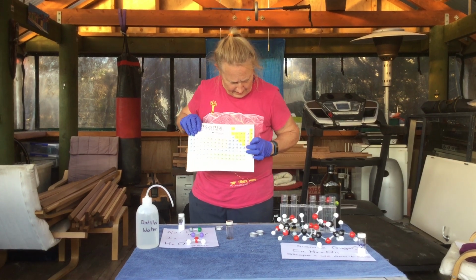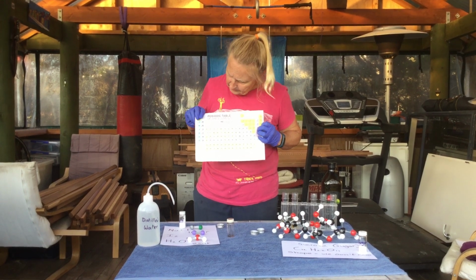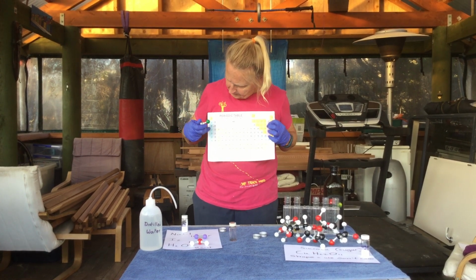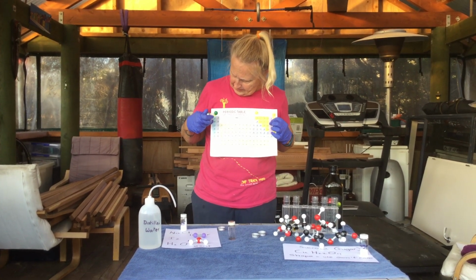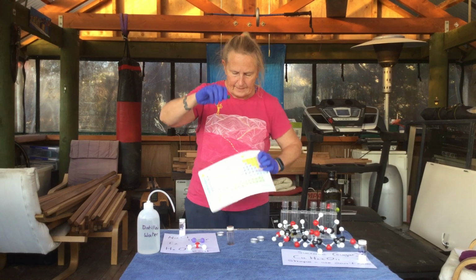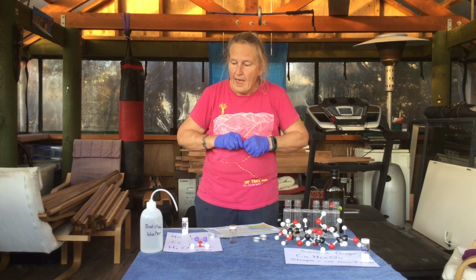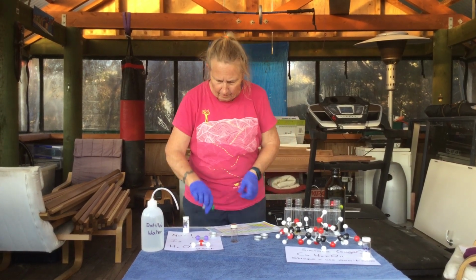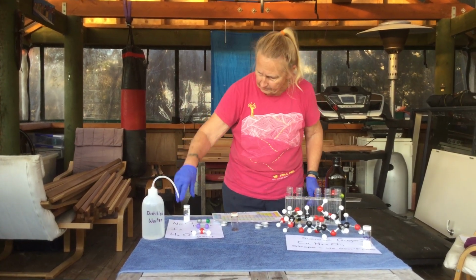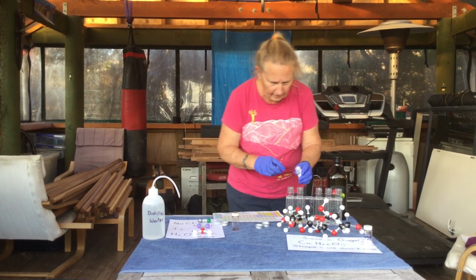Iodine is here on the periodic table, group 7, that's the halogens, and we know that sodium chloride is also in that same group, and we know that it forms an ionic bond between sodium and chlorine, and we know that an ionic bond means that it will fall apart when we put it in water, and we know that it's soluble in water. So I'm not going to bother to try that. I'm going to use the salt that we've got and see if that will be soluble in our oil.